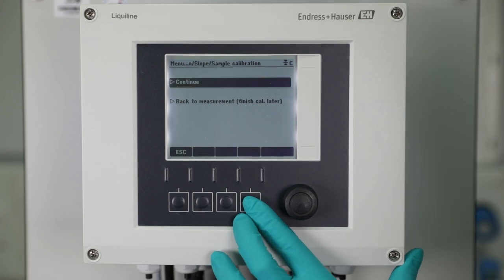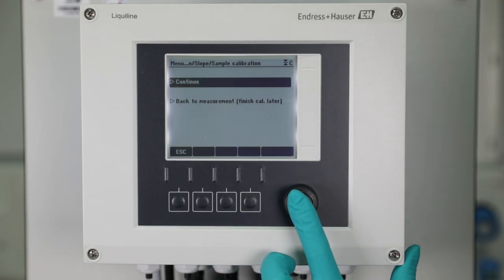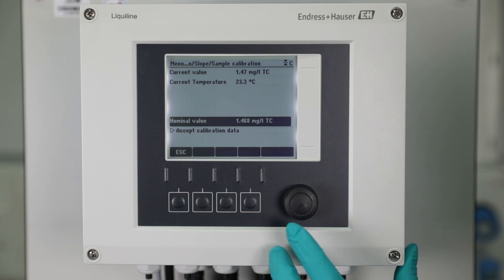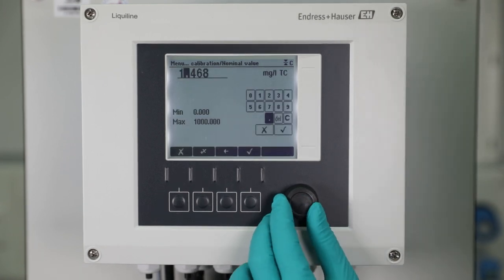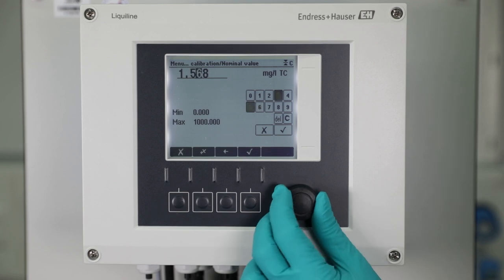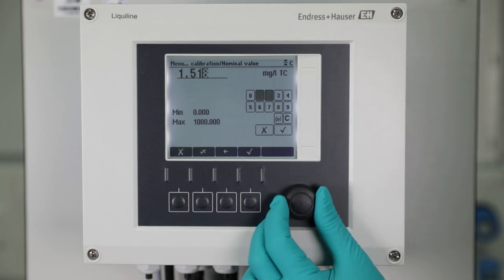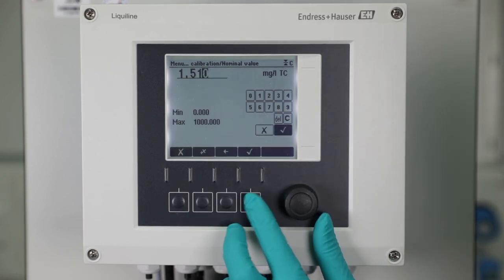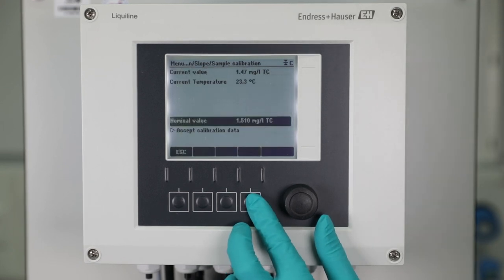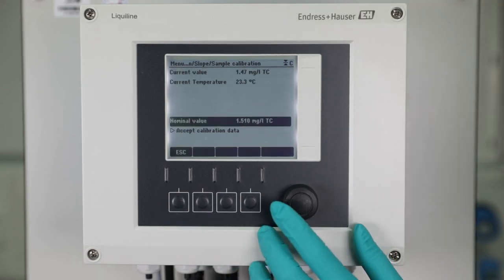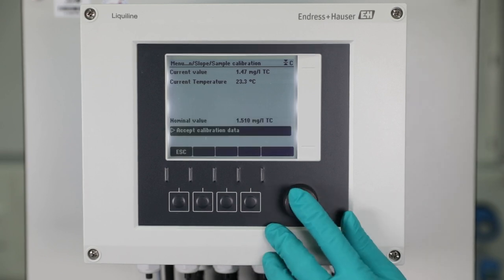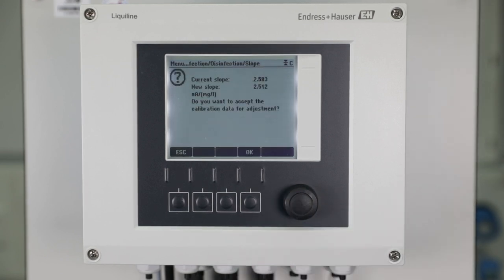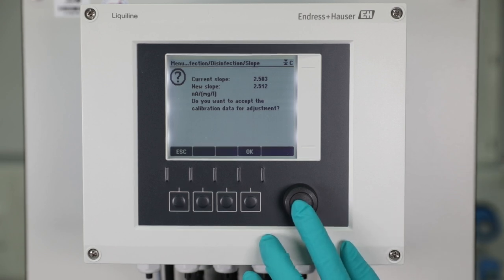Continue with the liquiline by entering the chlorine value which was shown on the photometer. Once the new slope was found to be within the allowed range, the transmitter allows you to store it in the CCS120D sensor head for adjustment.